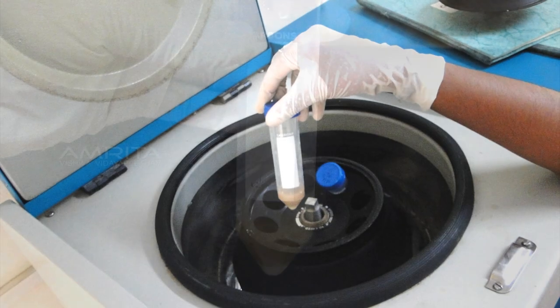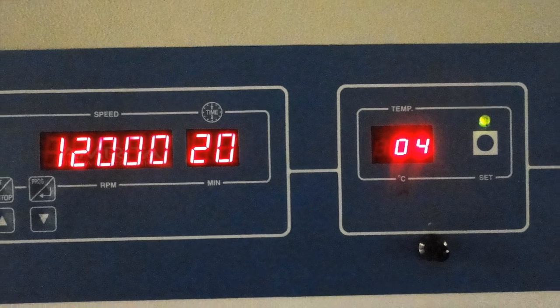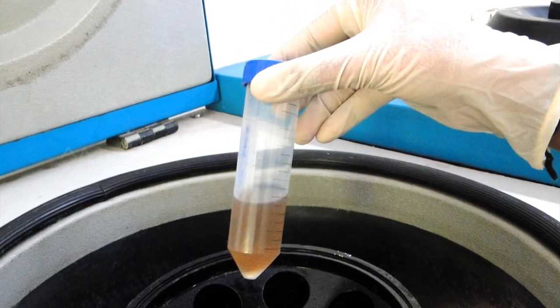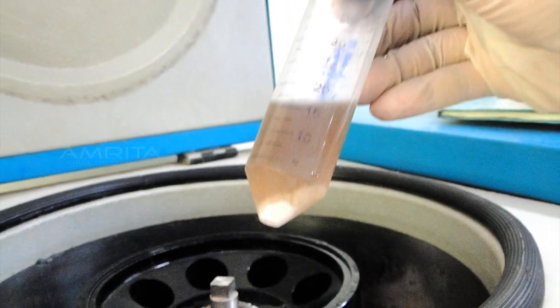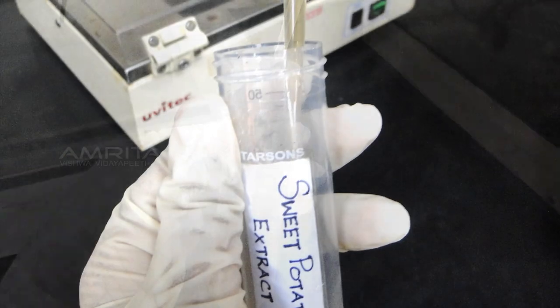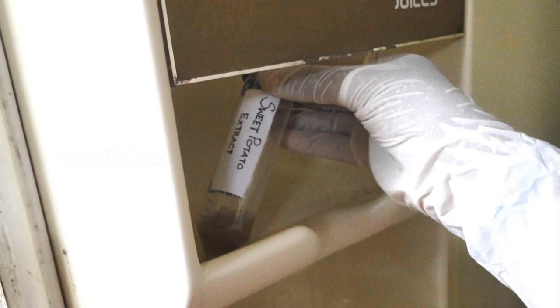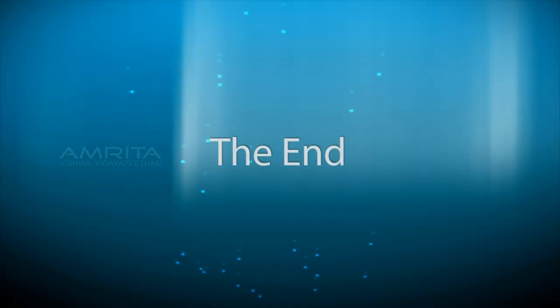Centrifuge the filtrate at 12,000 rpm for 20 minutes at 4 degrees Celsius. After centrifugation, take out the blue capped tube. Carefully transfer the supernatant into a new blue capped tube. The pellet is discarded and the supernatant is stored at 4 degrees Celsius in the refrigerator.